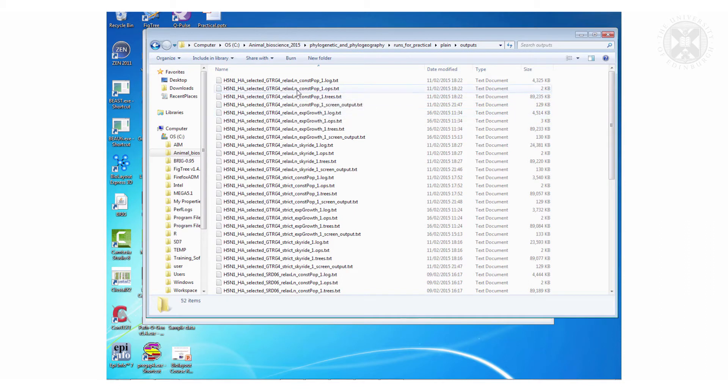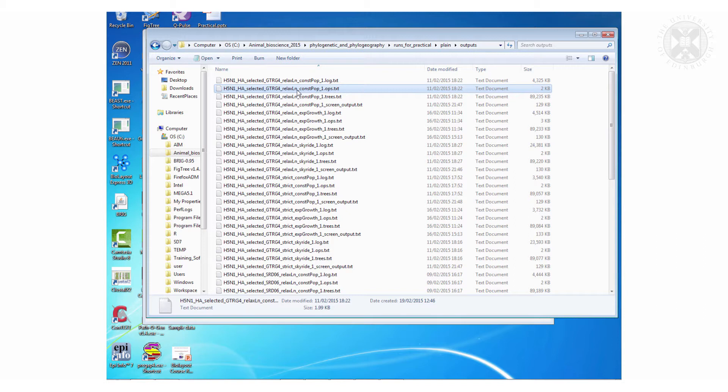You've also got this little ops file, which is a diagnostic file. It's to do with how well that MCMC chain was running. You don't actually need to do anything about that.